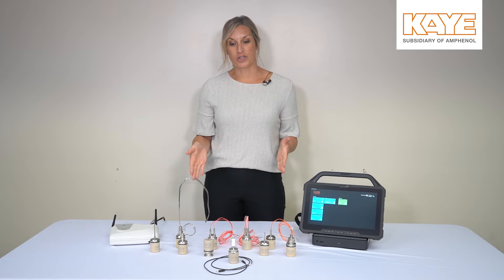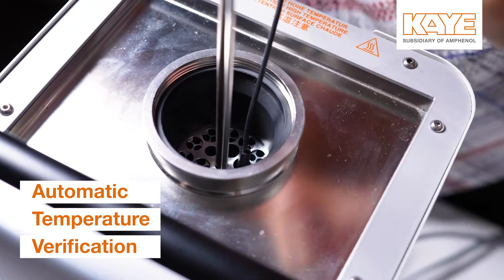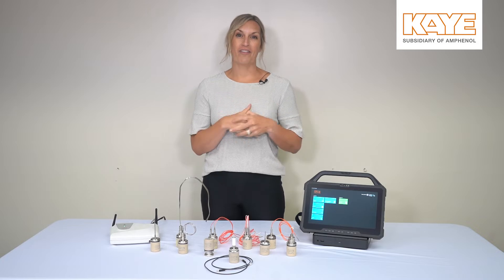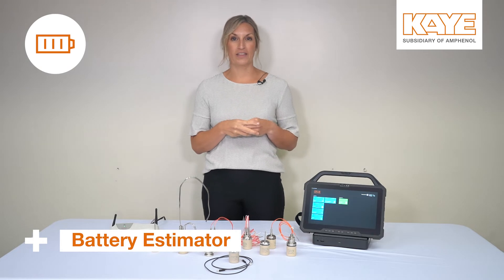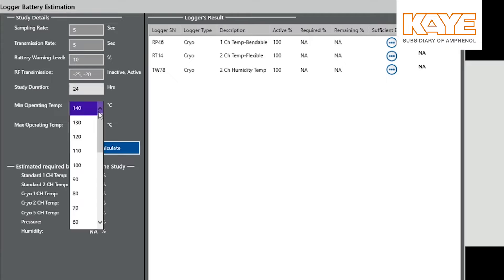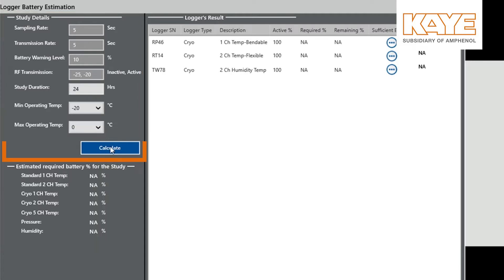Just like our temperature sensors, with the temperature and humidity logger, you still have the ability to do an automatic temperature verification and a humidity verification. One of the benefits of Valprobe RT 1.2 is that we now give you a battery estimator in the software. We've spent a lot of time on extending your battery life, so now when you go in to start your qualification, you can pull up the battery estimator and put in the details of your setup, and it will estimate how much battery life is going to be used to complete that study.